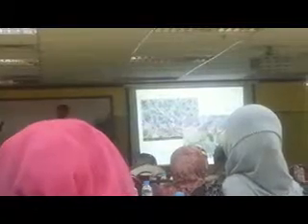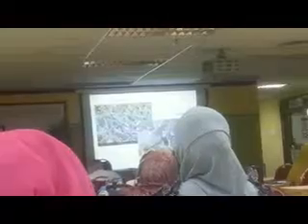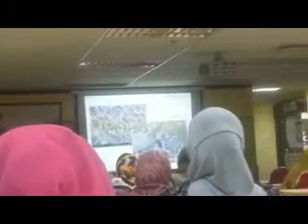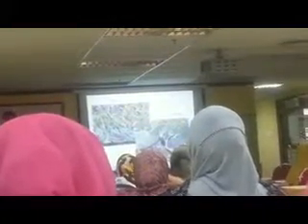And you can differentiate between your sample's toughness and ductility, whether your sample has deformed before failure or it didn't deform, just broke like glass. Because this is a typical feature of a ductile fracture. This is a typical feature of a brittle fracture. You will see a dimple fracture surface, but here you will see something like cleavage, right? You can differentiate between ductile and brittle fractures. So I suggest, whenever you do impact tests, tensile tests, or fatigue tests, you do the SEM analysis, fractographic analysis, and here you have to use secondary electrons. You cannot use backscatter, because secondary electrons can give the surface information.